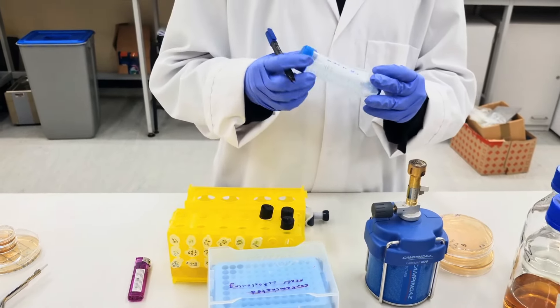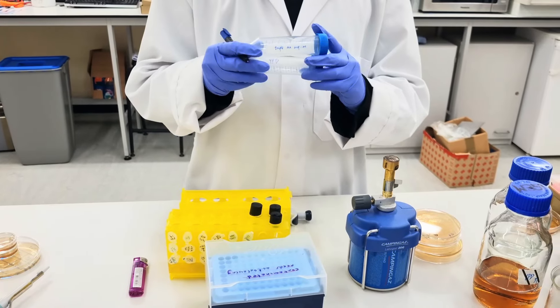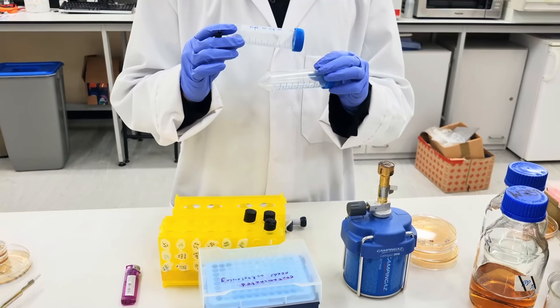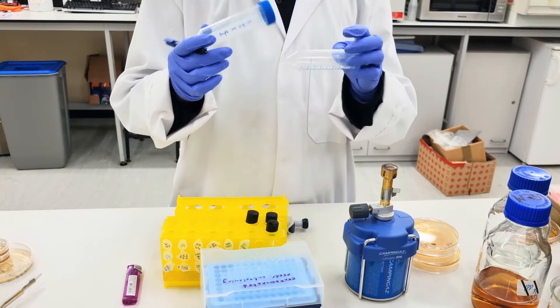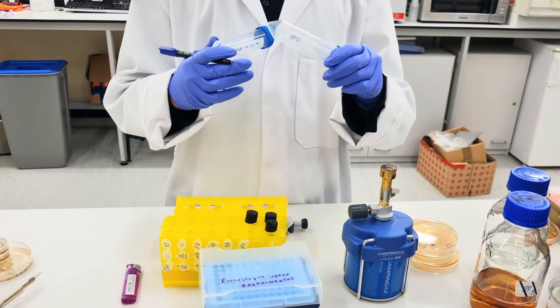And these two media are very useful for most yeast strains. You can do the selection in the liquid medium of the triple amino acid dropout and also you can do the single inoculation with YPD.